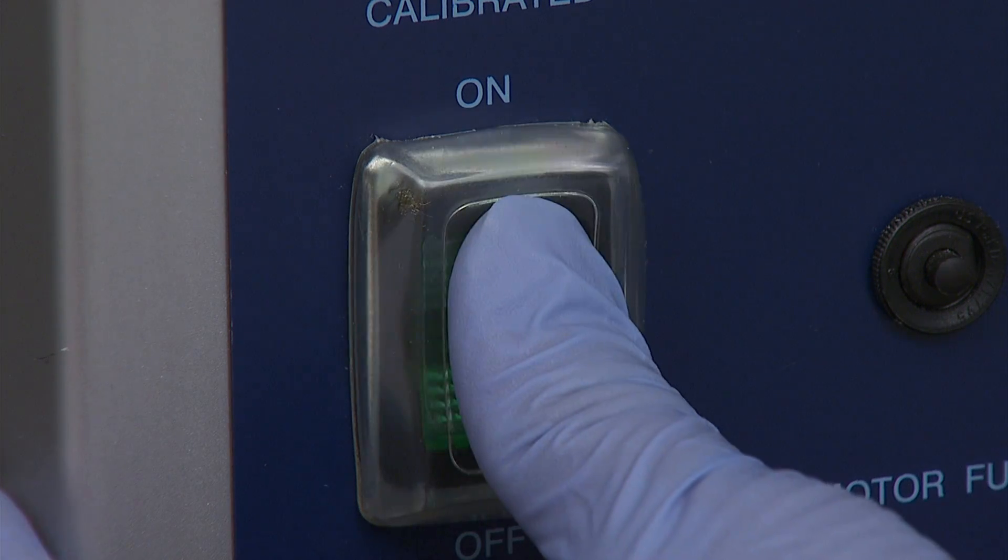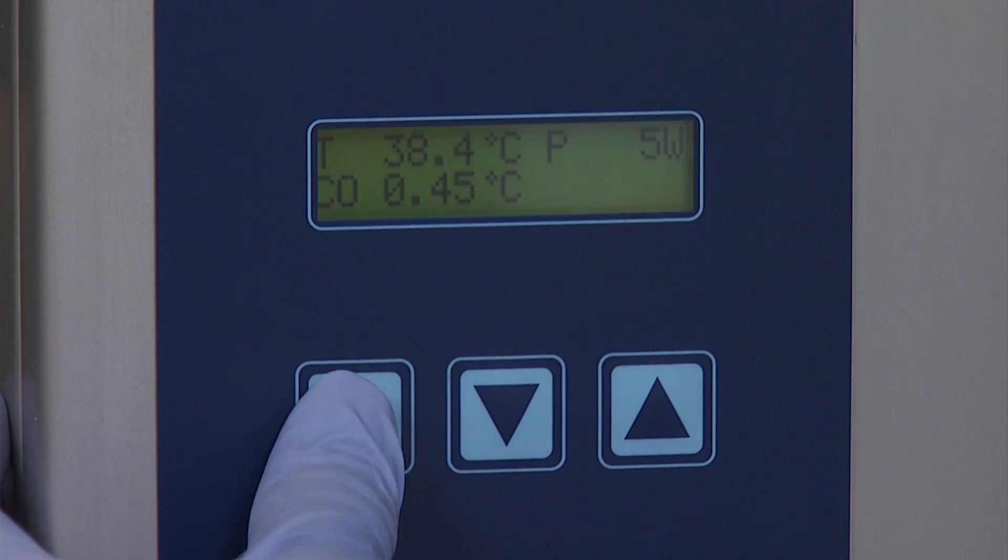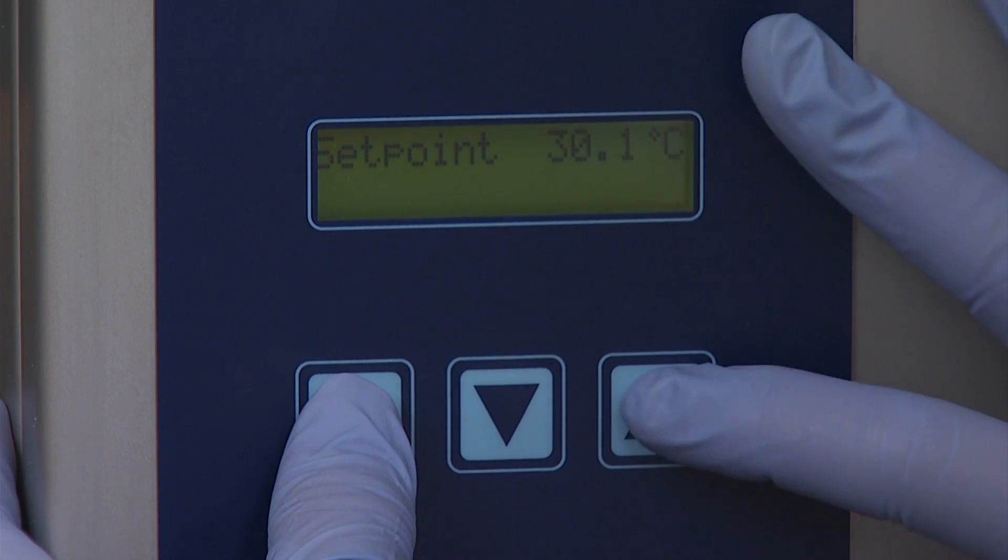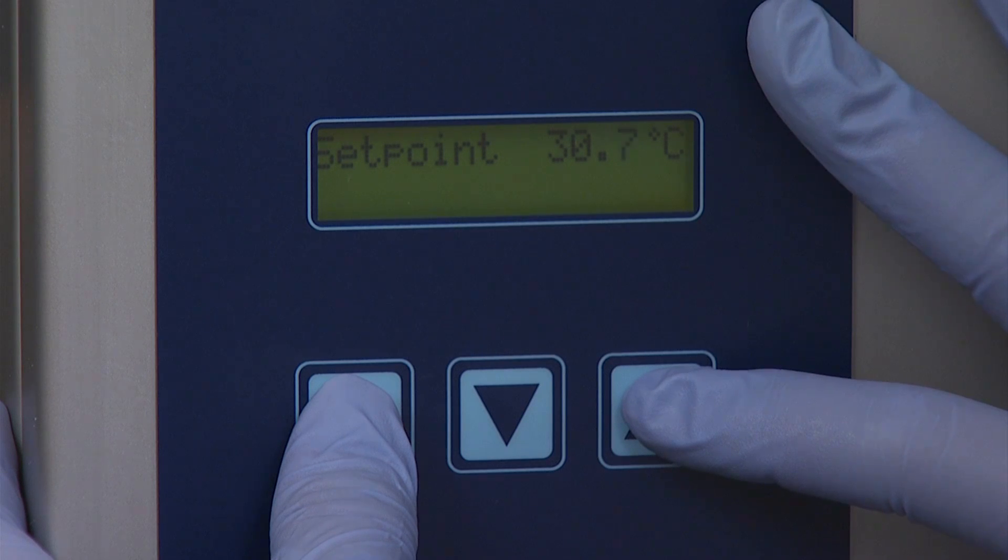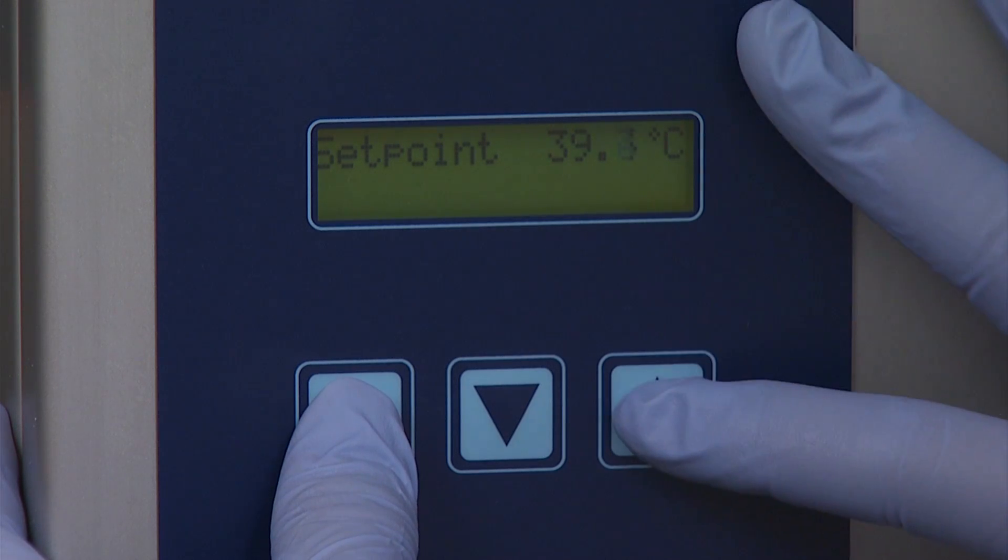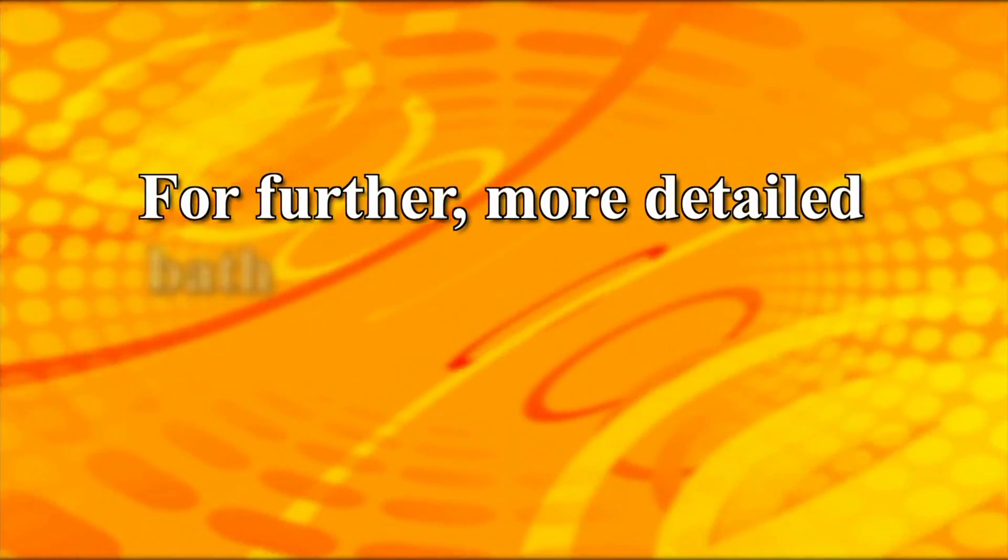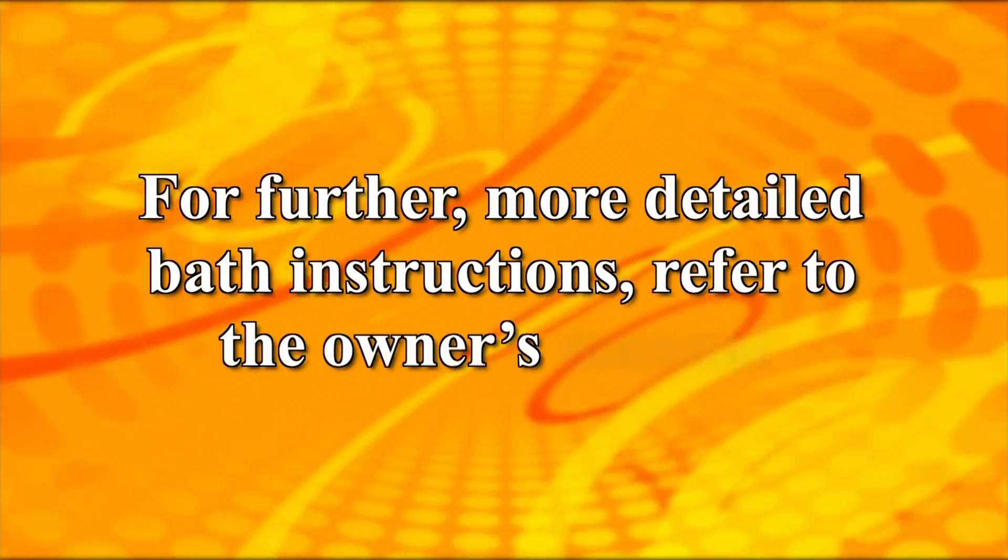Turn on the power to the viscometer bath and adjust the temperature to 40 degrees Celsius and ensure that temperature remains stable. The temperature set point can be adjusted by pressing the mode button until the set point option appears, then using the arrows to raise or lower the temperature set point. For further, more detailed bath instructions, refer to the owner's manual. Allow the bath approximately 30 minutes to come to temperature and stabilize.